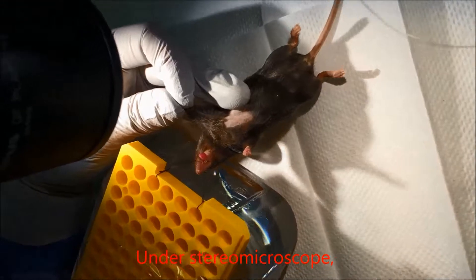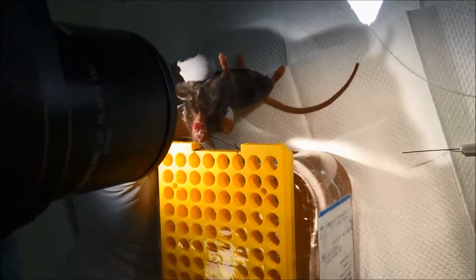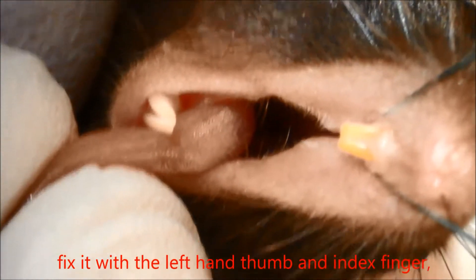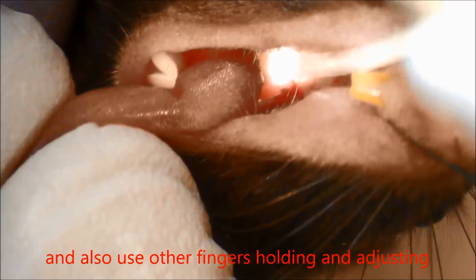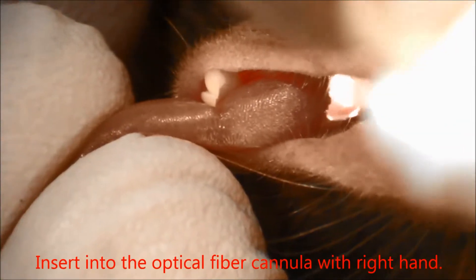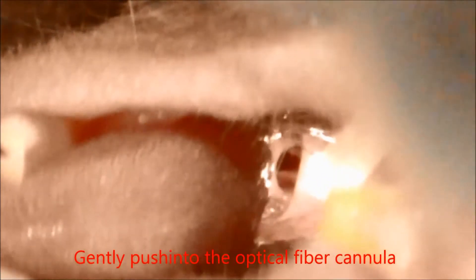Under stereomicroscope, suspend the anesthetized mouse on the support stand by its upper incisors. Using forceps, gently pull out the mouse tongue and fix it with the left hand thumb and index finger, using other fingers to hold and adjust the mouse neck and body position. Insert the optical fiber cannula with the right hand to expose the mouse vocal cords clearly. Gently push the optical fiber cannula through the vocal cords and into the trachea.